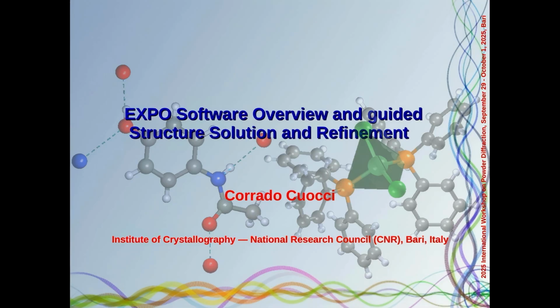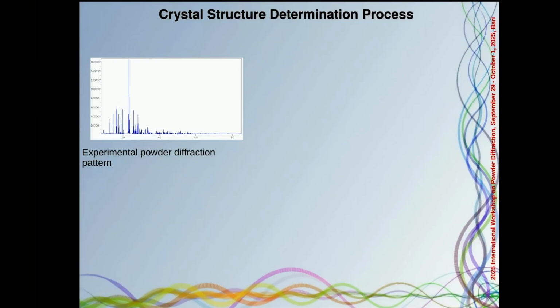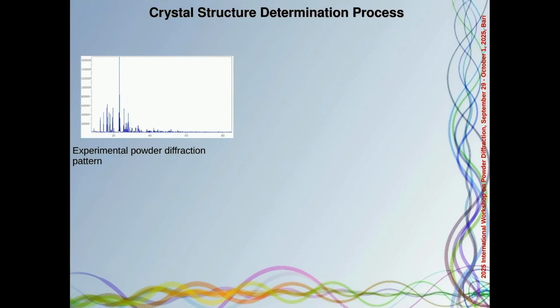I will talk about the process of structure solution and refinement using EXPO. You can find this presentation in the shared folder called presentations. EXPO is a program able to perform all the steps of the process of crystal structure determination.